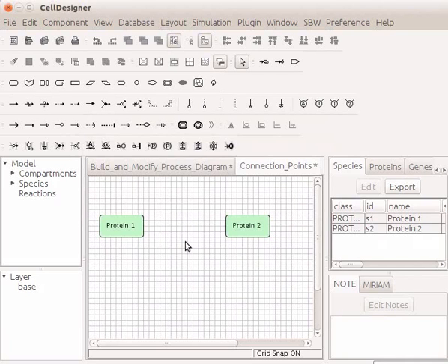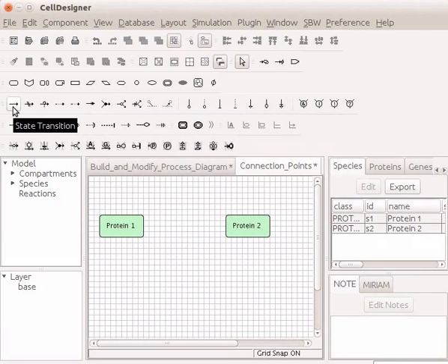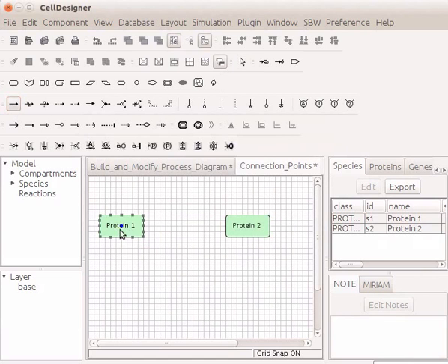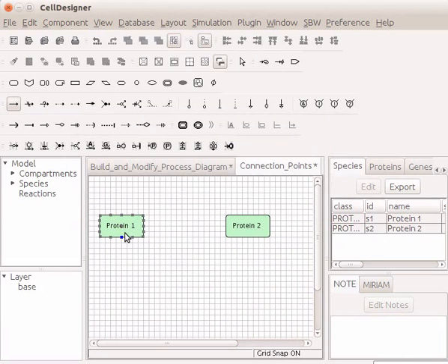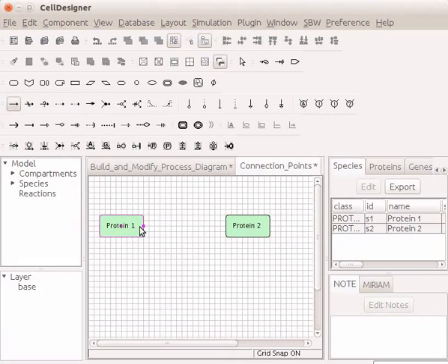In the main menu, click on the icon for State Transition. Then, on the draw area, hover the mouse on start point species Protein1. Observe that all 16 connection points are highlighted in gray color. Note that when the cursor is pointed to one of these connection points, it will change to blue color. Let's click on one of these connection points.